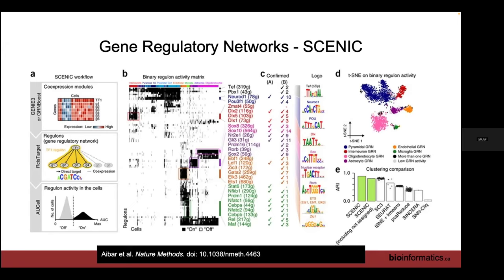So do all the genes with the transcription factor binding site correlate with each other? It builds up this matrix of which genes are assigned to which regulon and which transcription factor, double checks for enrichment of motifs or peaks in ATAC-seq, and builds up your t-SNE or clusters based on these identified regulons, as it calls them. This mainly only works for mouse or human data because you need this external motif information, but it works reasonably well.